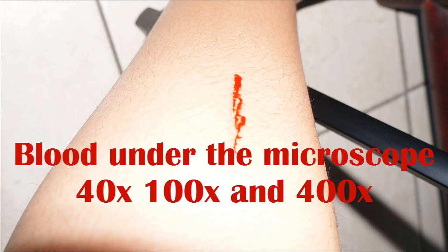I want to warn you because this is a biological substance, so if you're not handling your own blood, be careful with it. It's recommended to use gloves also. I'll just leave you with the video and the microscope pictures. Please enjoy.